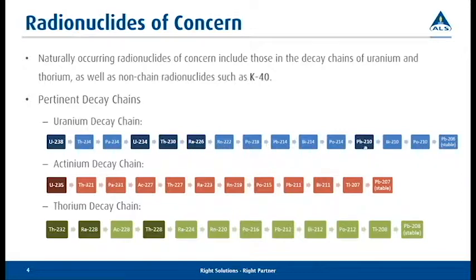Even for uranium, if you're in an area that has it, those can also be tested. We are set up here to do the NIOSH 7300 for uranium if needed for a number of places. So that is the only one that has an actual OSHA method. None of the other radionuclides really, they tend to still default back over into your EPA methodologies. There hasn't been anything set up specifically in OSHA for a test for radionuclides for most of these things.